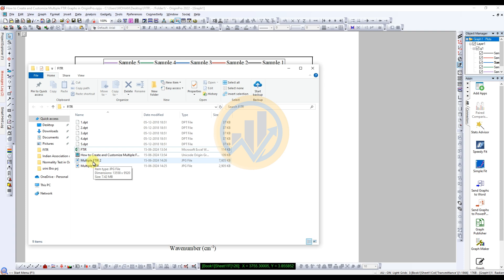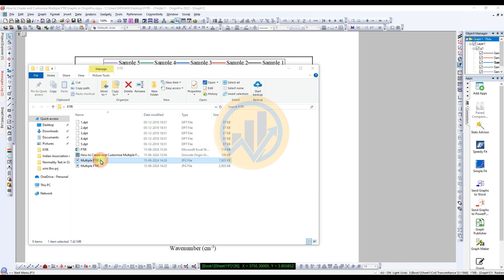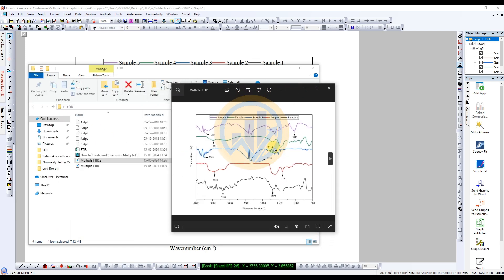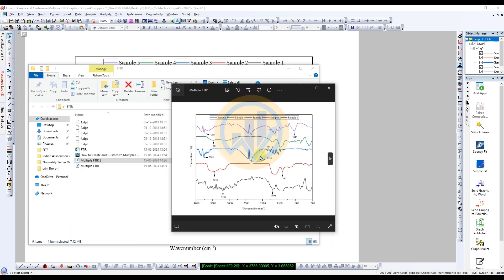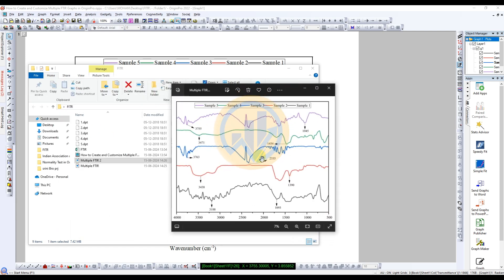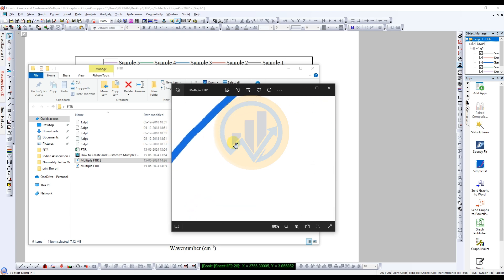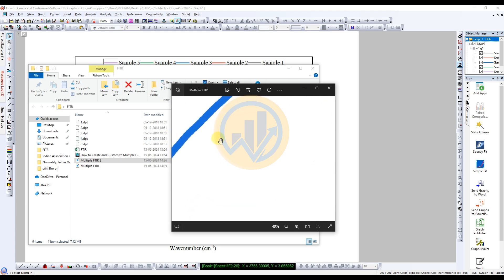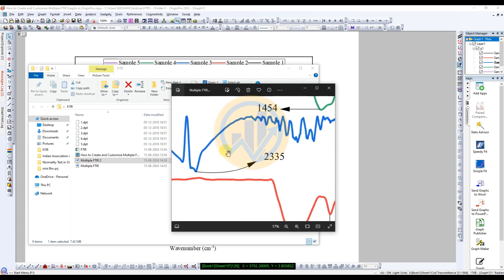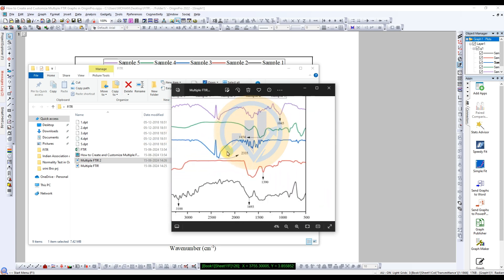This is a very high quality graph. Open the graph and zoom in — no broken pixels. This is the export method in OriginPro software.